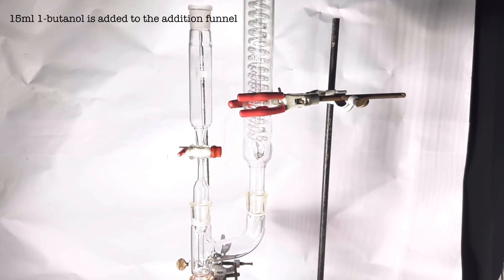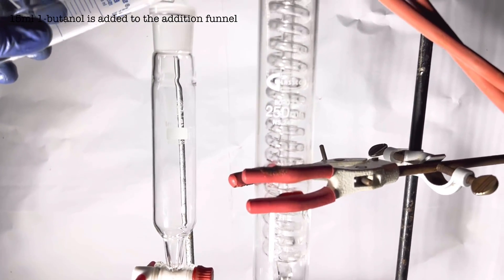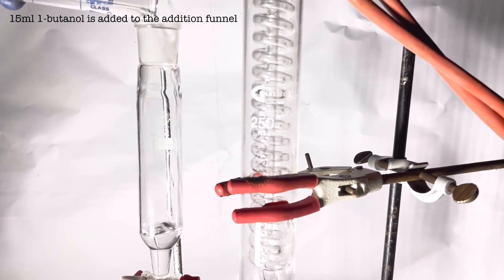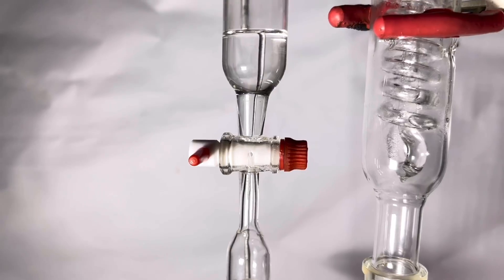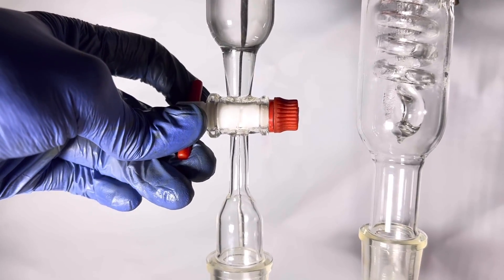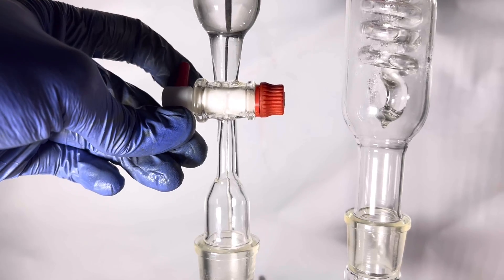15 milliliters of one butanol or n-butanol was added to the addition funnel. Make sure that the stopcock is closed before adding the alcohol. Slowly turn the knob of the stopcock and allow the alcohol to fall in the chromic acid solution drop by drop.